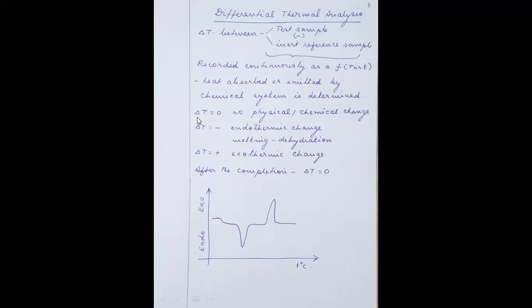Now you see, if the temperature difference between the sample and the inert reference sample is zero, this means that no physical and no chemical change has taken place.